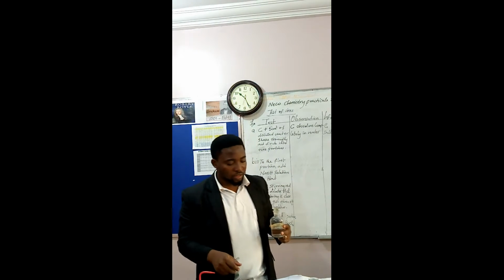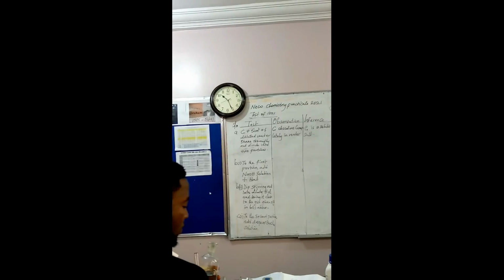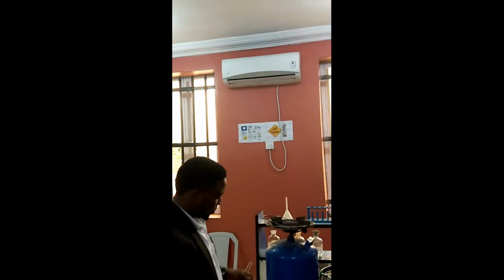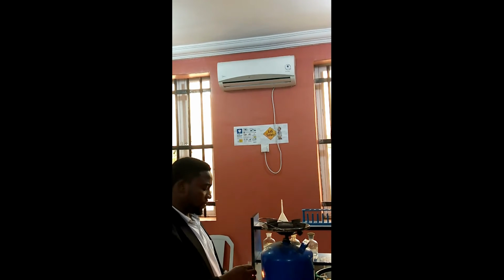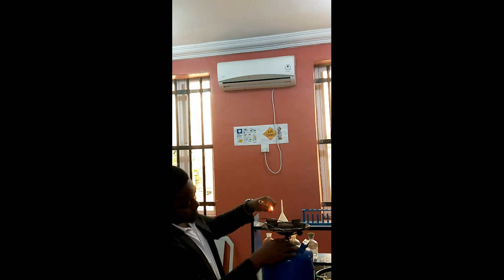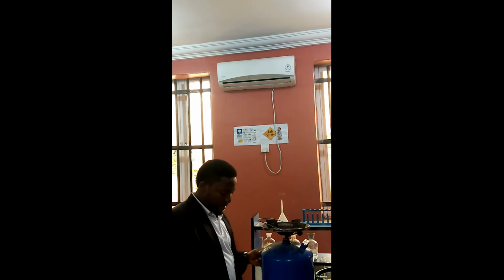So I'm taking everything to the heating source where I will heat the solution. So I need to light my gas.